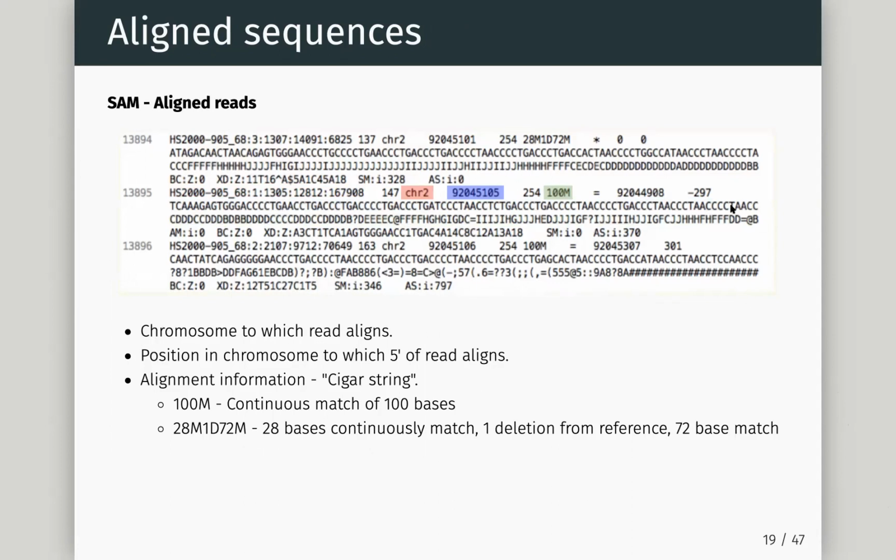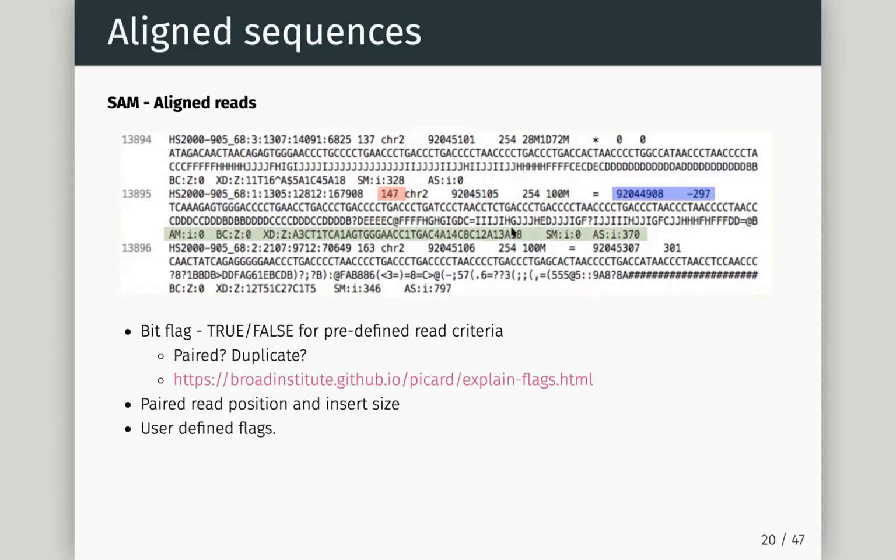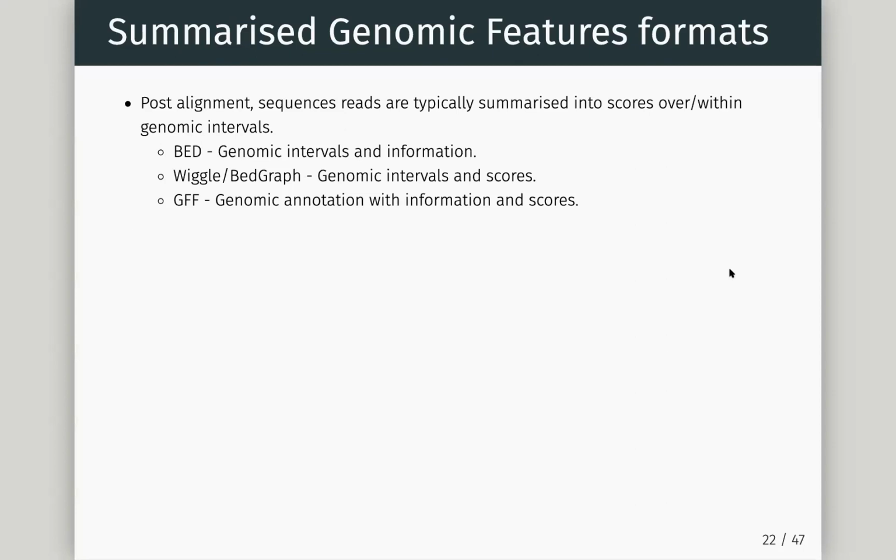Yes, a SAM file is irrespective of the reference. It's a universal truth that you can take this number, from the Picard website, and translate it. That's the really beautiful thing about SAM format, it's universal. Mosquito, human, mouse, whatever the reference genome, once it's aligned, this just tells you the chromosome, position, etc. So it's reference genome irrespective.